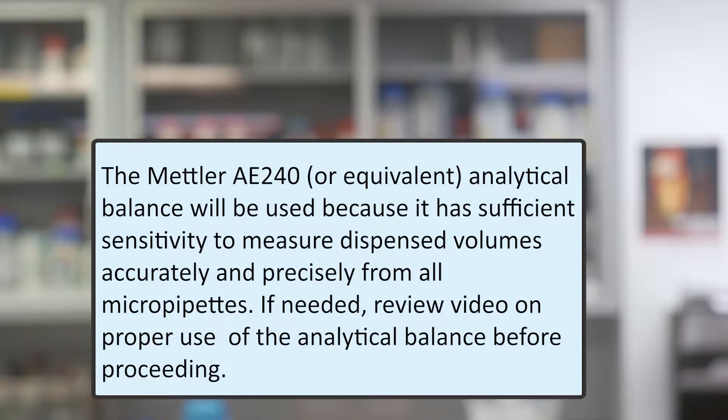The Mettler AE240 analytical balance will be used because it has sufficient sensitivity to measure dispensed volumes accurately and precisely from all micropipettes. If needed, review the video on proper use of the analytical balance before proceeding.